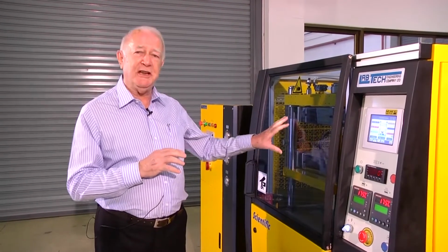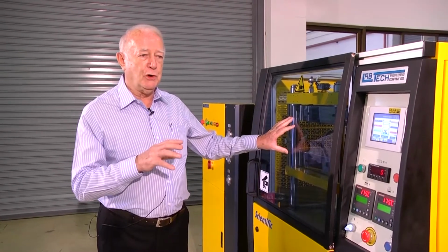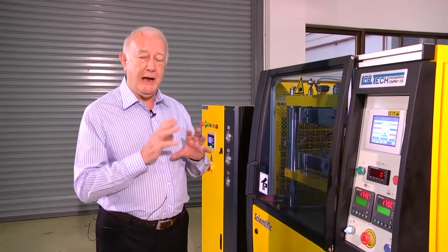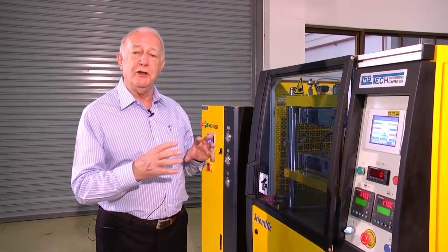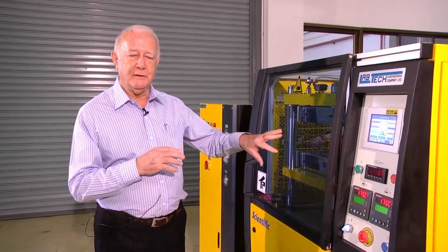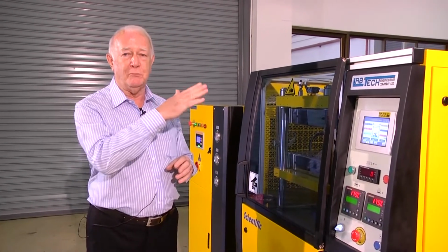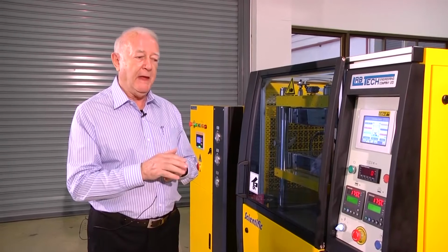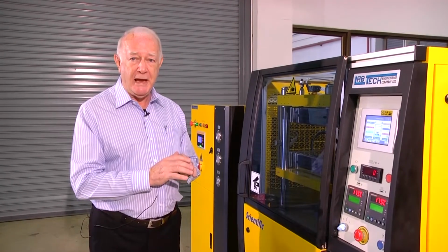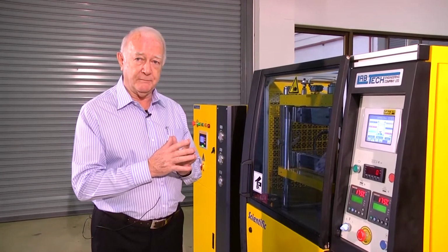Now with ASTM cooling, we have controlled temperature of the cooling water and controlled temperature of the press, so that we've programmed the cooling rate so that we get a very uniform and linear cooling rate, and according to the ASTM standard, it should be 15 degrees C per minute.